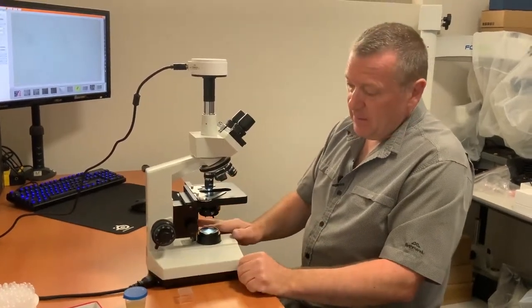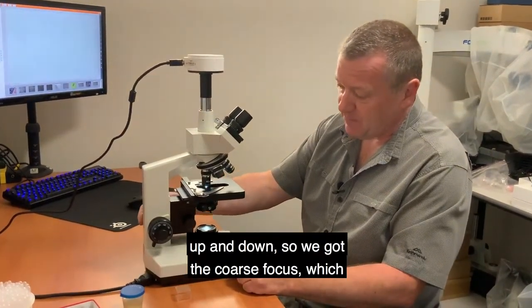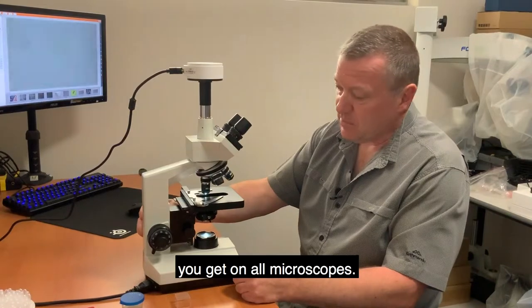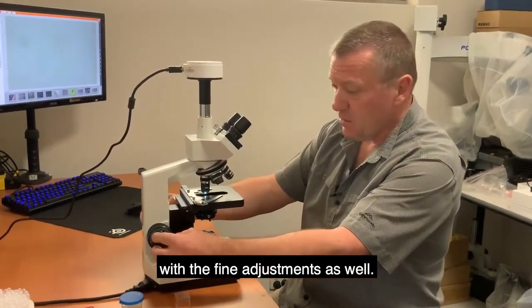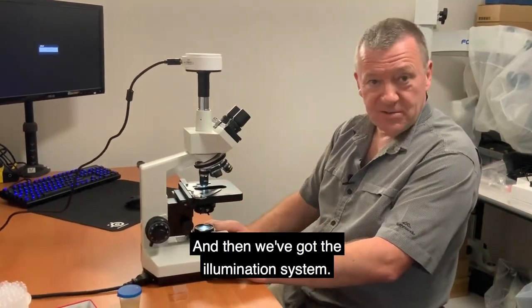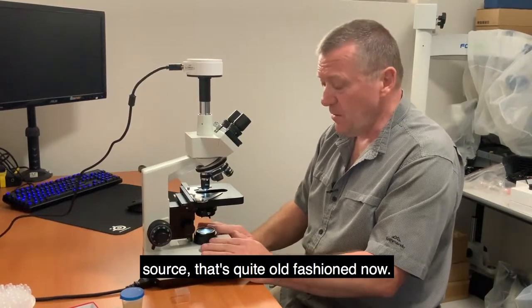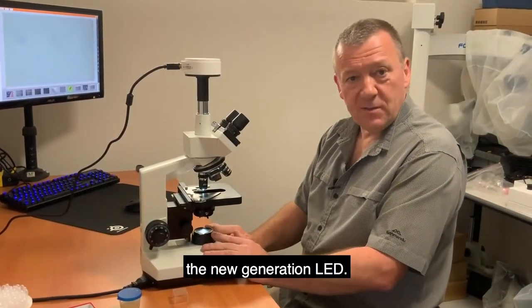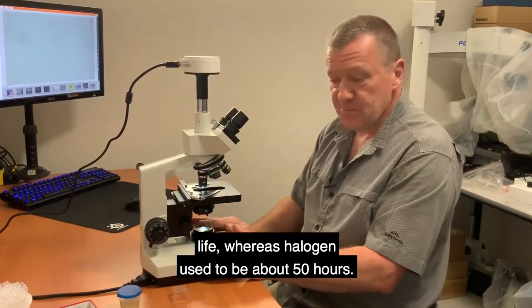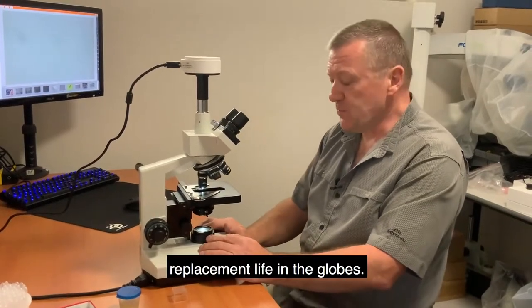The focusing moves the stage plate up and down. We have coarse focus, which you get on all microscopes, but you really need fine focus adjustment as well — and this microscope has both. For illumination, you can get microscopes with a halogen light source, but that's quite old-fashioned now. All our new microscopes use LED, which gives a much longer lamp life: halogen used to be about 50 hours, while LED gives you about 10,000 hours replacement life.